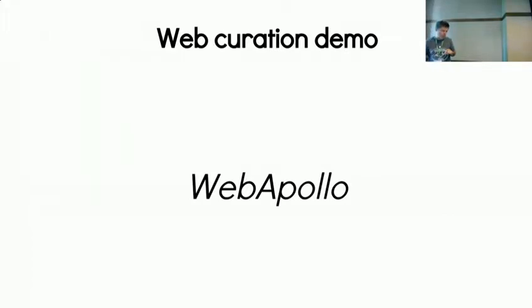And the other point, as Troster covered earlier, the nice thing about manual annotation is you have large groups of people, and people tend to focus on aspects of a genome or a set of organisms in a particular genomic region. So it's very common, or probably more common, to do this using a genomic browser. I'm going to go back in, since we're just doing a demo, and show you some of the other things it can do.